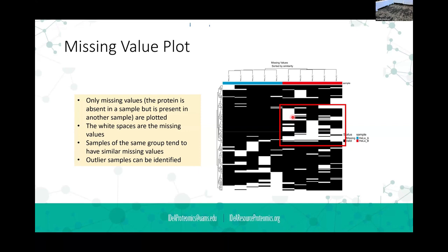So regarding the glycosylation masking the sites for digestion, is there any strategy to solve that problem? Yeah, you can treat with a deglycosidase, so you can remove some of the sugar with just a non-specific glycosidase, and then subject it to digestion. Yep. Great questions. Good stuff. Okay.